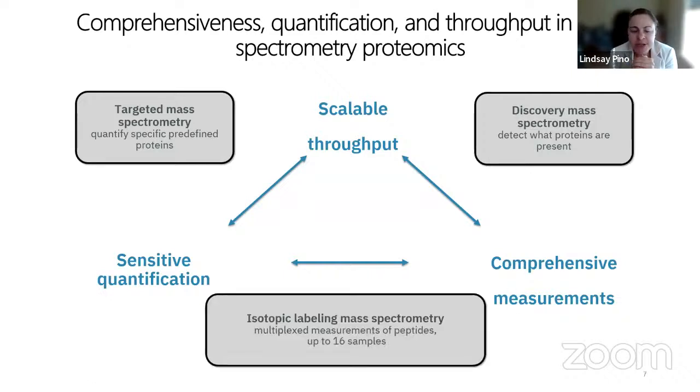So finally, Sue mentioned these isotopic labeling approaches. These combine the ability to get that protein list with better quantification than if you just did a regular DDA experiment. She mentioned things like TMT and iTRAQ. These are kits that you purchase, you prep your samples, you label your samples, you mix them together. Typically, you then fractionate.